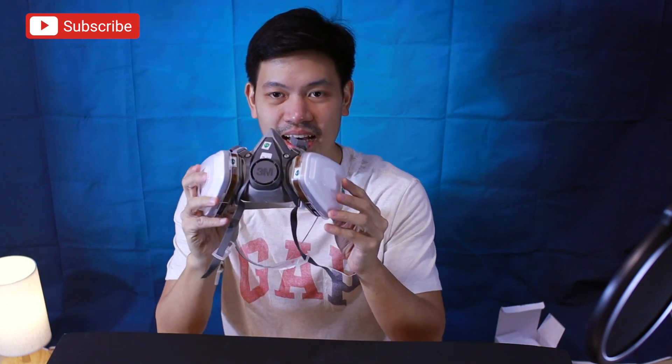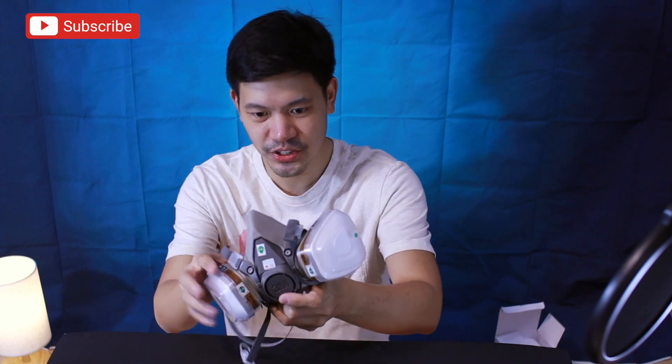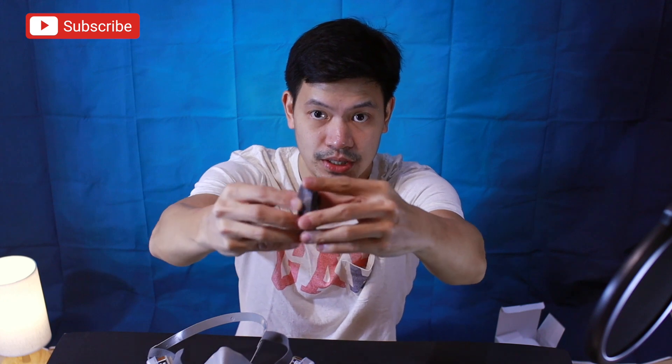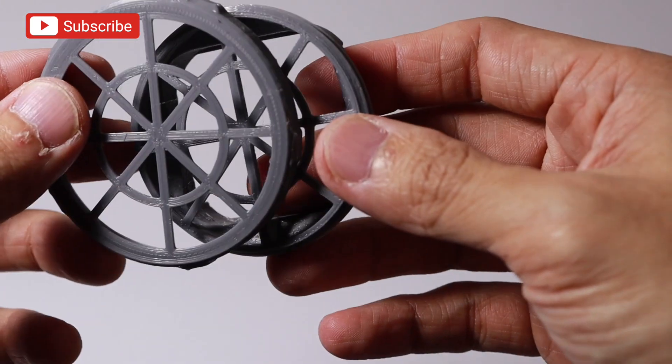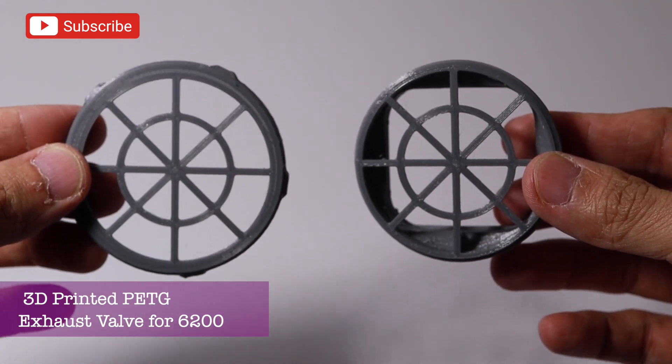Going back — dito naman tayo sa half-face respirator ng 3M, the 6200 model. Ito na, cartridge na to. Ang ganda, very sleek yung design. So this time, yung exhaust valve is nandito natin ilalagay. Ito kasi yung exhaust valve — 3D printed din, PETG rin yan. Matibay, tsaka iba siya so natitwist siya, you can twist and then iwalay siya.